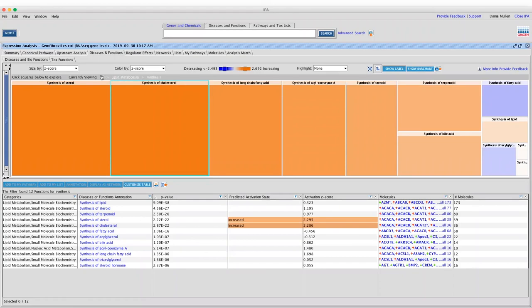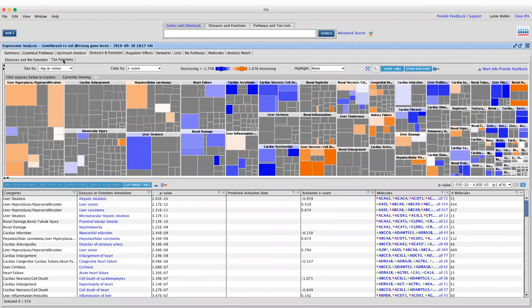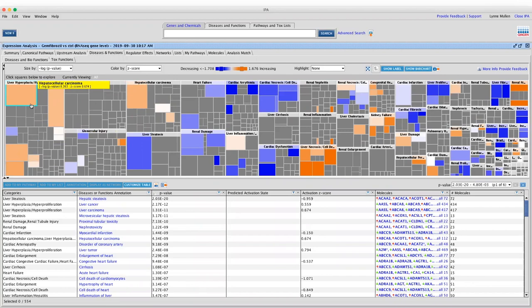Clicking down through the hierarchy eventually brings you to a downstream effects analysis showing the evidence for effects, just as we saw with upstream regulators. You can navigate back using the white hyperlinks. The table below shows the main parent category and the bottom-level child category, skipping intermediate categories, along with p-values, z-scores, and associated molecules. We also have a Tox Functions option with tox lists created upon customer request — for those who ran a tox analysis, this is where you'd find that information.